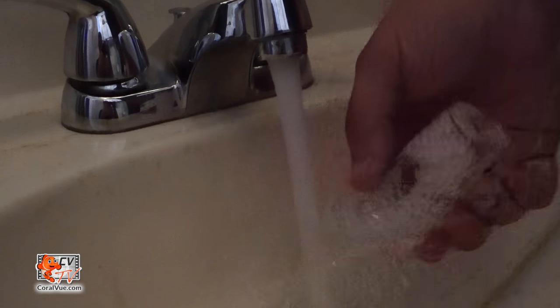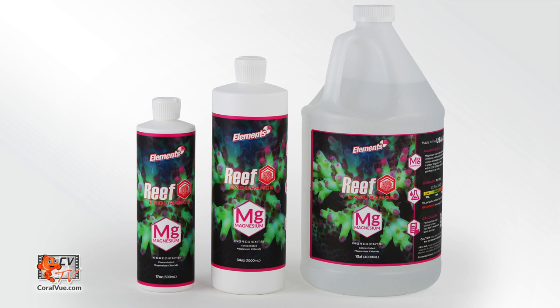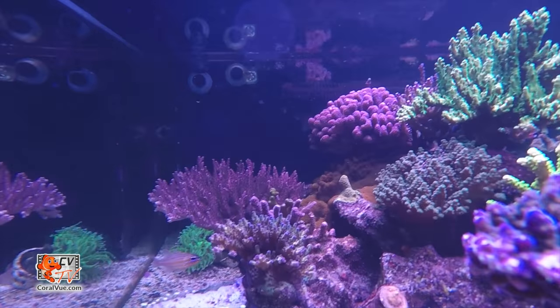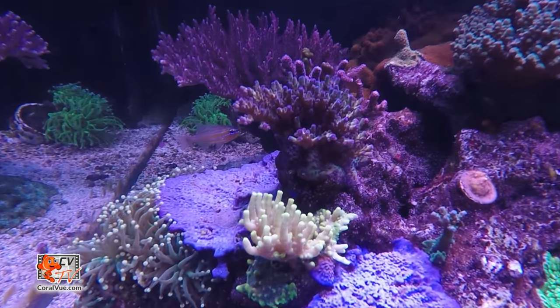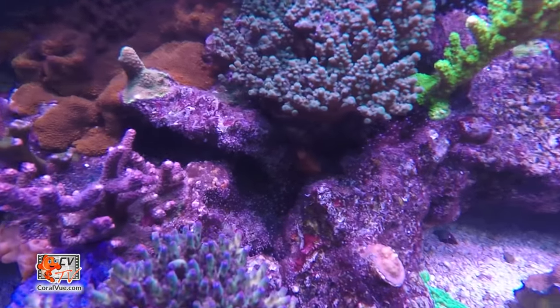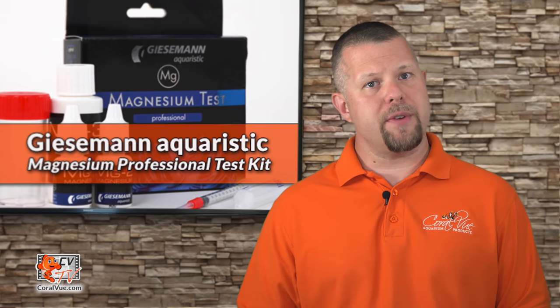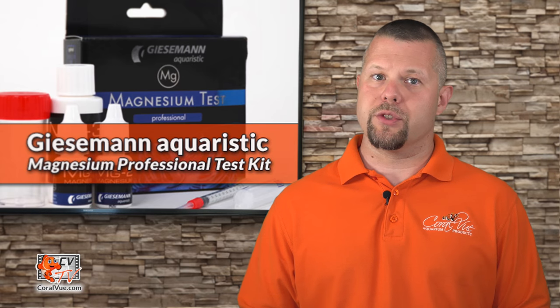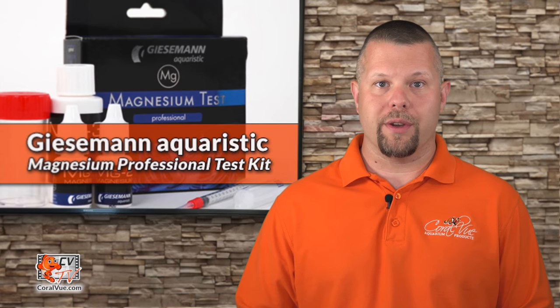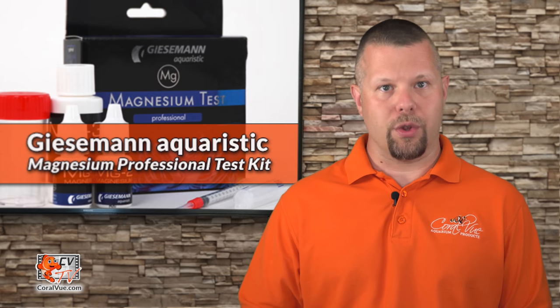Rinse the test vial and measuring syringe with tap water and store. Depending on your magnesium reading, you may need to supplement or adjust your current regimen accordingly. Keeping our water parameters at optimal levels and ensuring that our corals have access to the very basic building blocks needed to grow and thrive will increase our success rate. As reef hobbyists, we have one single job: maintain water quality. That is the key to enjoying a tank full of happy and colorful corals.